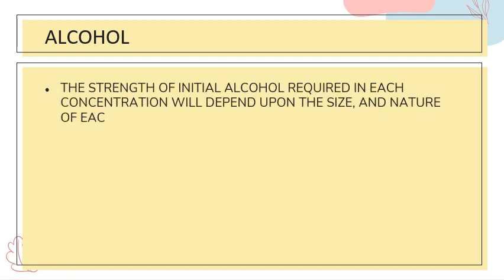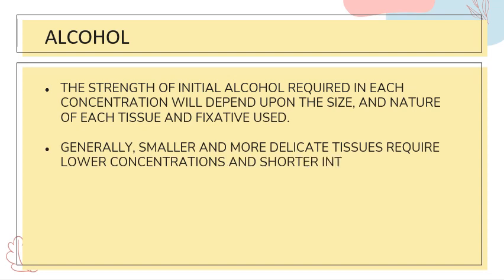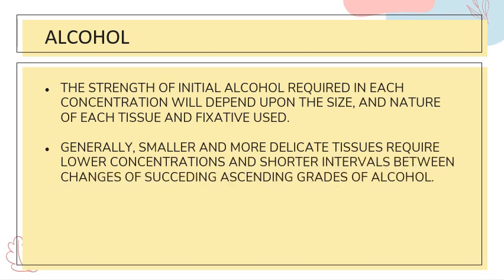So the strength of initial alcohol required in each concentration will depend upon the size and nature of each tissue and the fixative that is used. Generally, the smaller and more delicate tissues will require lower concentrations, starting from 30% concentration, and shorter intervals between changes of succeeding ascending grades of alcohol. It should always be ascending.